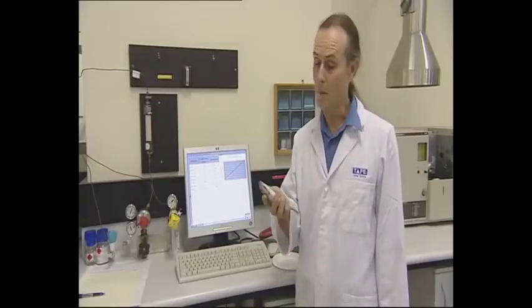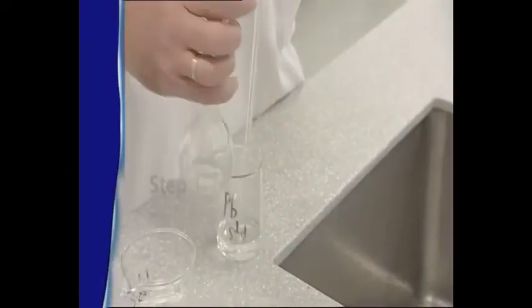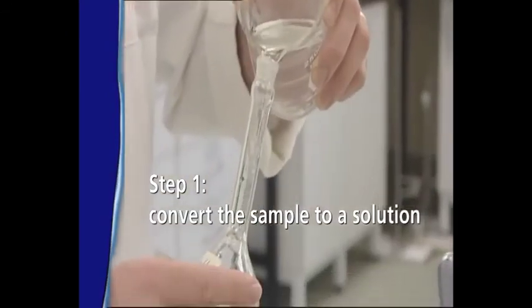In order to perform an analysis with AAS, we need to complete a few simple steps. We'll use the analysis of lead in this fish as an example. The first step in the process is to get the fish into a form that can be analysed. AAS only analyses liquids. Solids and gases must first be turned into a liquid before we can perform any sort of analysis.